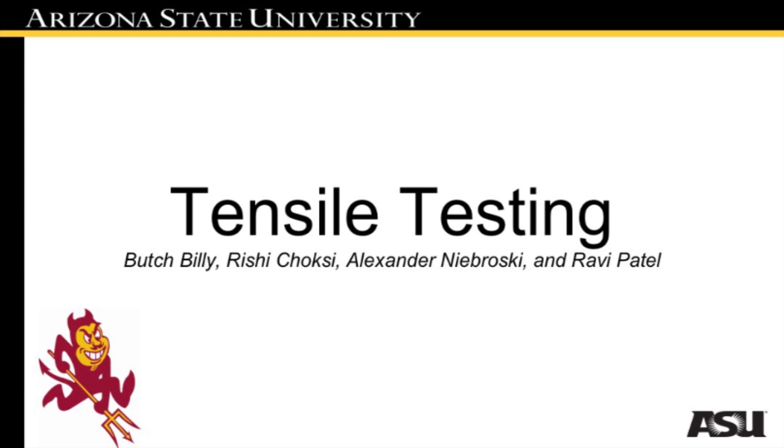In this video, presented by the Material Science and Engineering Department of Arizona State University, we will be discussing the process of testing the mechanical properties of metals using a tensile tester.